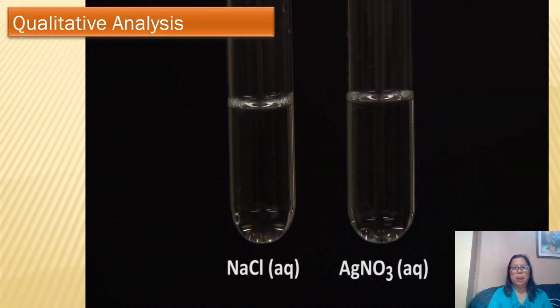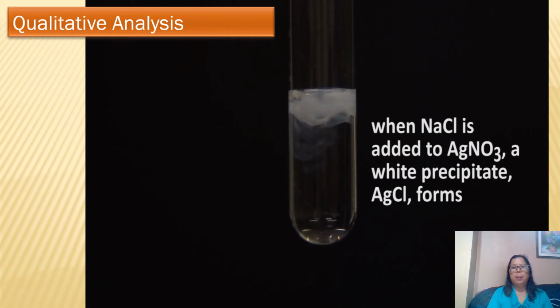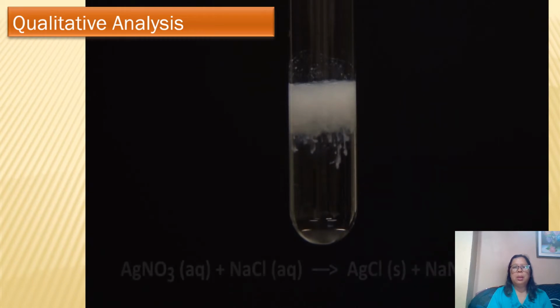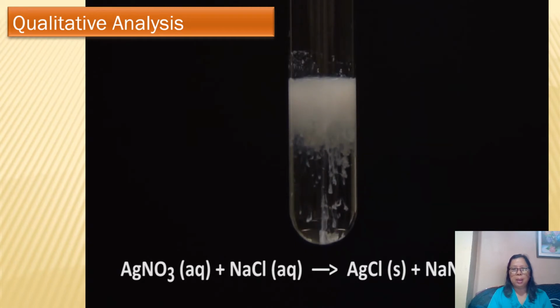I will show to you an illustration as to how to do qualitative analysis. It could be illustrated in a manner that in a test tube you're going to add a substance or a chemical to test for its presence. So this is a sodium chloride solution, and we are going to test for the presence of the chloride. For example, it is unknown. So when sodium chloride is added to silver nitrate, a white precipitate is formed. So this confirms that this contains silver.